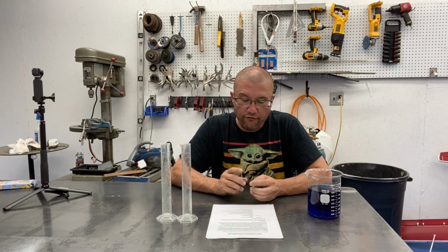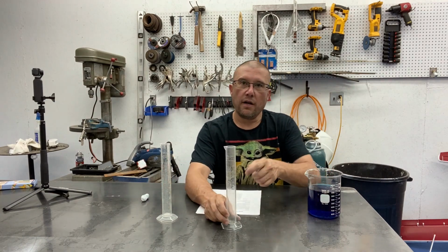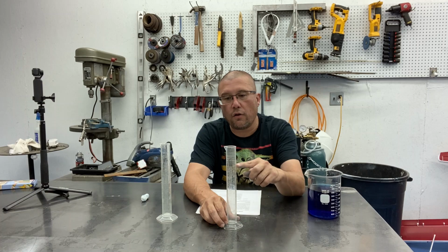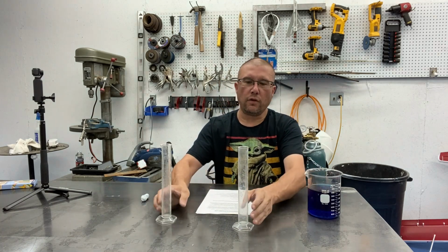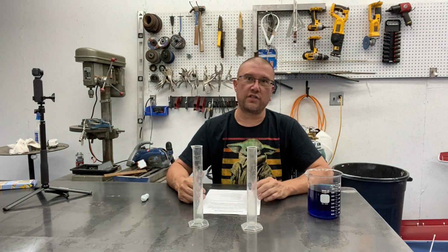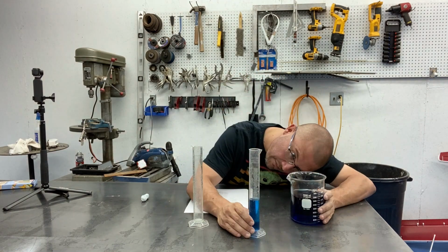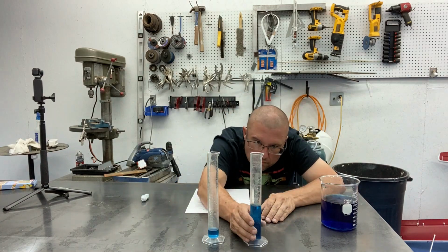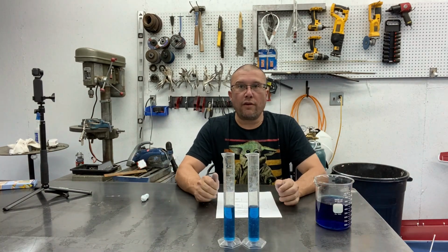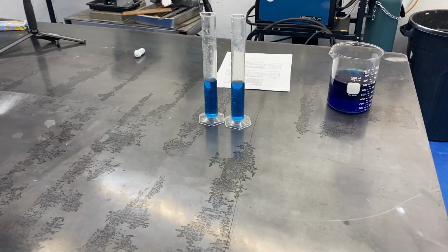Test 1. Fill the graduated cylinder with 50 milliliters of water. You can't see it from there, but these graduated cylinders have marks from all the way at the bottom of 10 milliliters all the way up to 100. So we're going to be very careful. I'm going to do 2 at a time so that we can move a little quicker in this lab. I know you're going to get bored if it's 30 minutes long. I'm going to be as accurate and precise as I can. So I filled both these graduated cylinders with exactly 50 milliliters of water. Let's take a look.